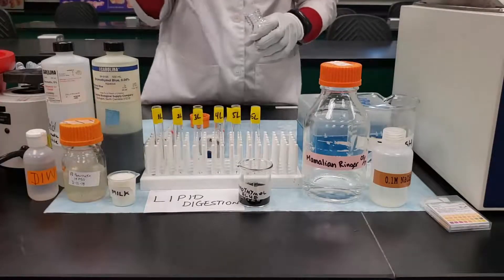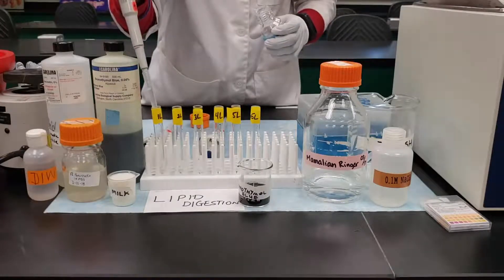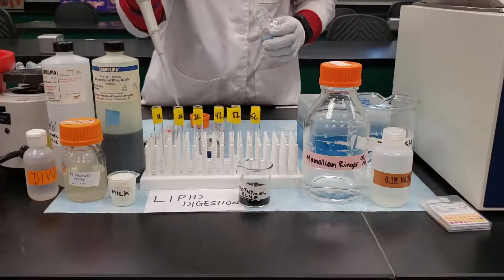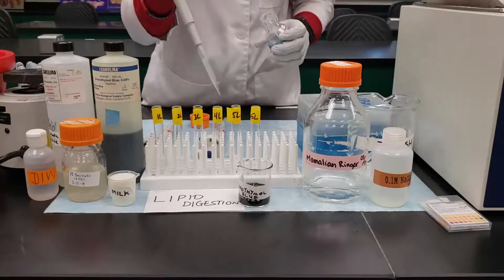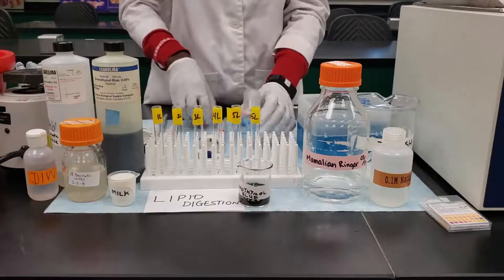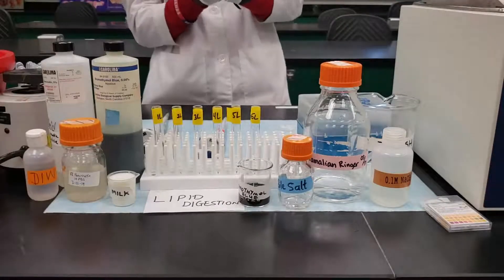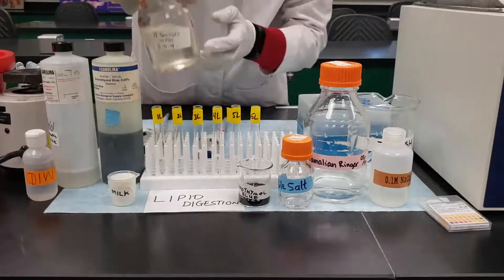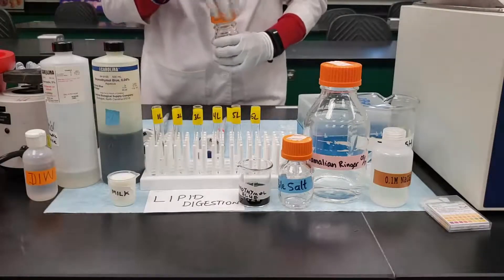The bile salt is very potent and required for the activity of the lipase. Since it's an emulsifier, it breaks the fat molecules, increases the surface area of the fat, and allows the lipase to act on it for better digestion and activity. After adding the bile salt, take the pancreatic juice and add 1 mL to tubes 1, 4, and 5.